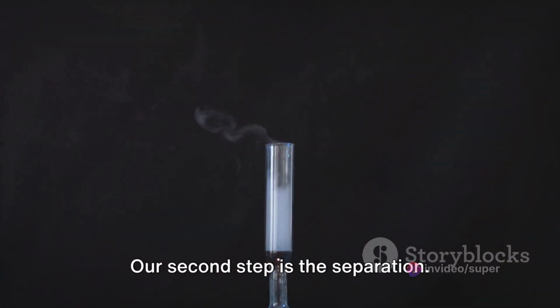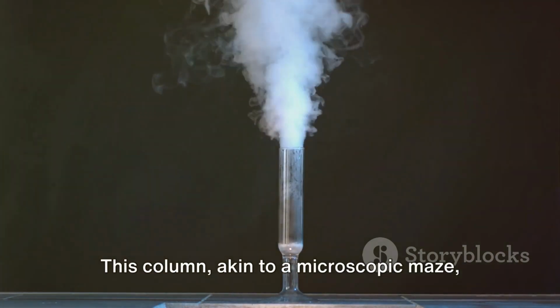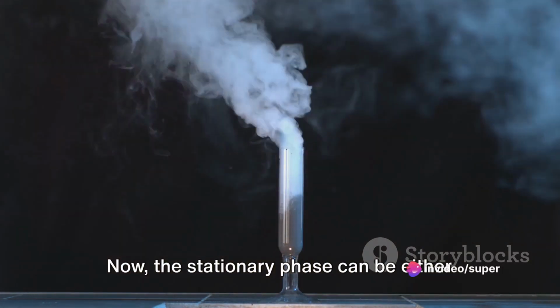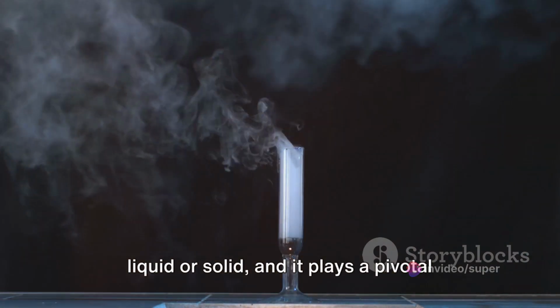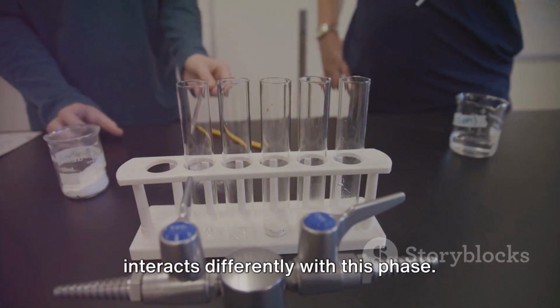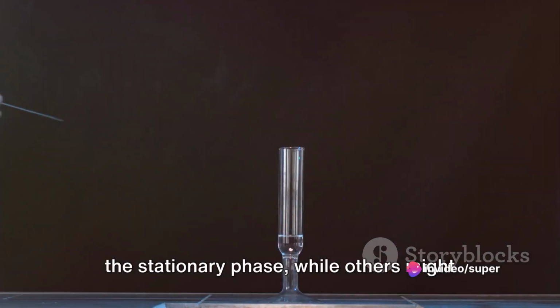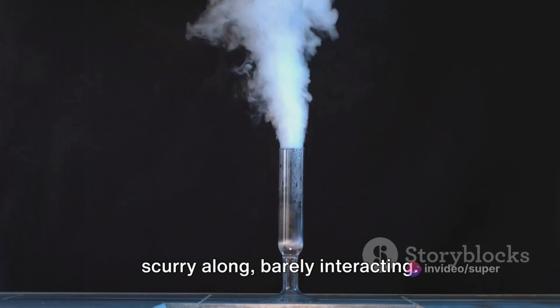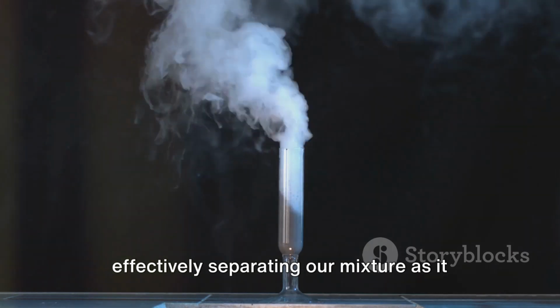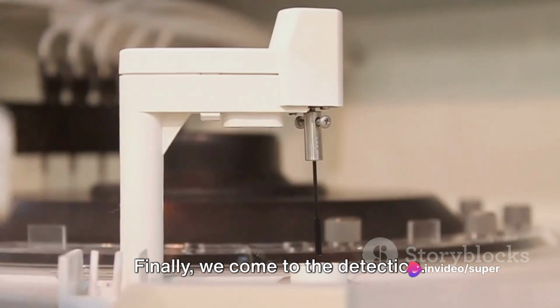Our second step is the separation. The vaporized sample mixture is now traveling through a long coiled column. This column, akin to a microscopic maze, is packed with a stationary phase. Now, the stationary phase can be either liquid or solid, and it plays a pivotal role in our process. Each component in our sample mixture interacts differently with this phase. Some might linger, forming a bond with the stationary phase, while others might scurry along, barely interacting. This difference in interaction directly affects the travel time of each molecule, effectively separating our mixture as it moves through the column.